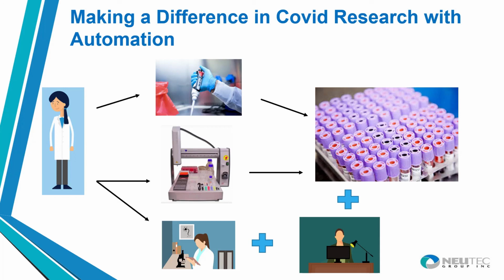You simply tell the instrument how much to put in and program it for where it's at. And then you tell it to go run the program, and it goes in and fills all of these bottles automatically without anybody actually doing any of the labor. So it eliminates the need for somebody to be sitting and pipetting, which can get very boring, to the point where there's the potential for mistakes, but also that person's tied up with that task all day.